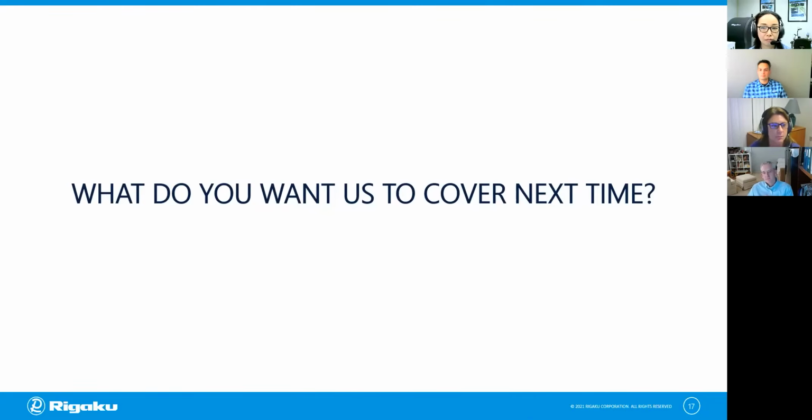All right, so we'll launch the last poll question. In this question, we'd like to know which CT data analysis technique you would like us to cover in the next Dragonfly episode that'll take place later this year. So object separation, deep learning, additional quantitative analyses that we can do, or other, and in that case, perhaps be more specific in the chat. I'll just leave this here for a couple of seconds, and whoever wins, that's what we'll cover for the next webinar.